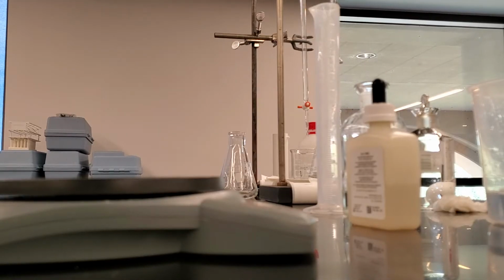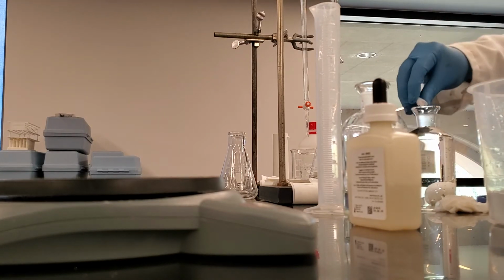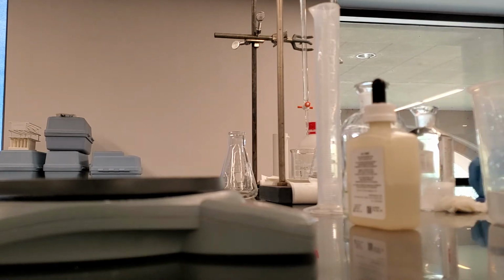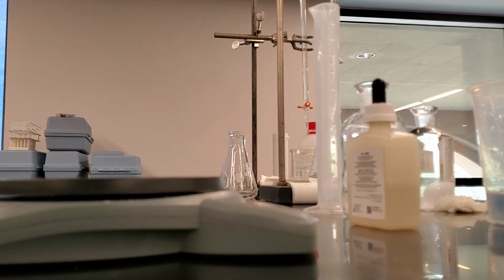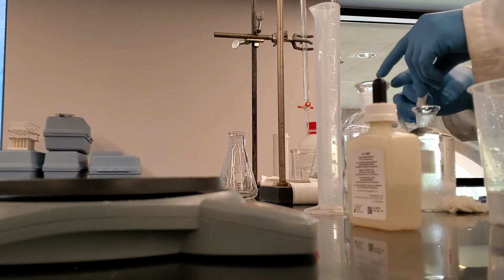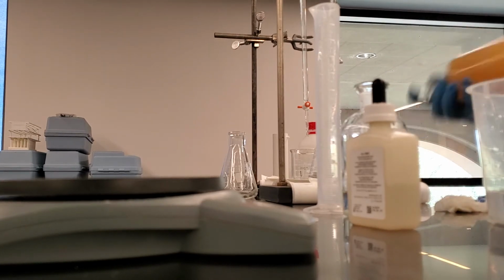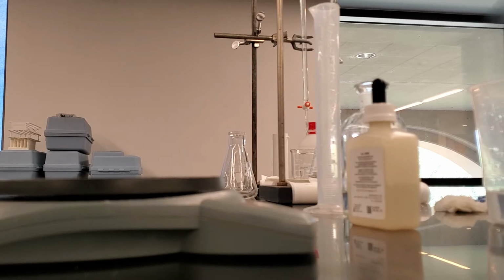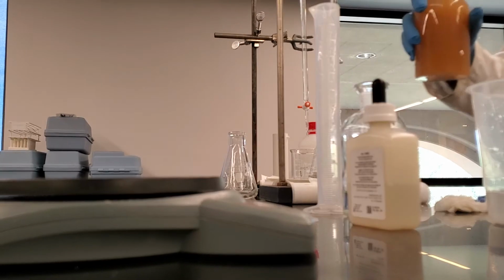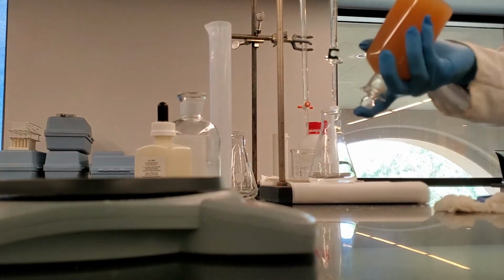So first I'm going to add manganese sulfate. And then I'm going to add alkaline iodide azide reagent. Cap it, mix it. It says invert several times until you find an orange brown precipitate. This one looks like an orange brown precipitate. I mix it really well.